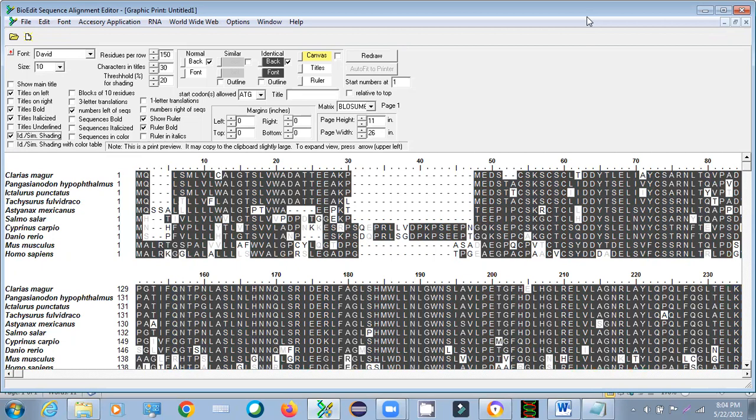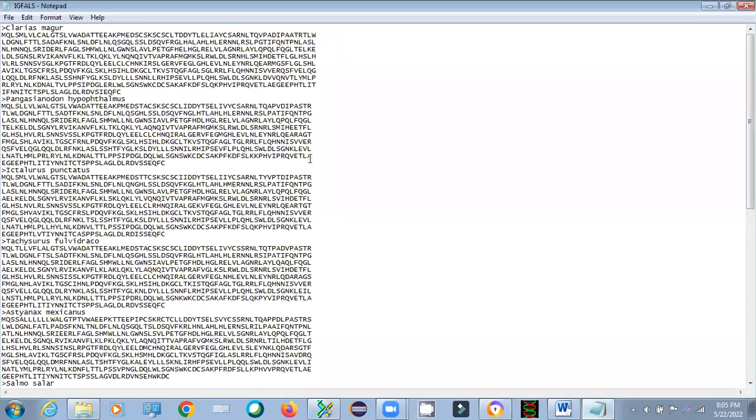So that is the purpose for today. I hope this video is useful for you, and it will be helpful for me also if I forget in future. I can use that video for making this type of images. This file we can also use for phylogenetic tree analysis, because the alignment file we have generated can be used for making the phylogenetic tree also. So in a later video we'll discuss how we can generate the phylogenetic tree using MEGA software.